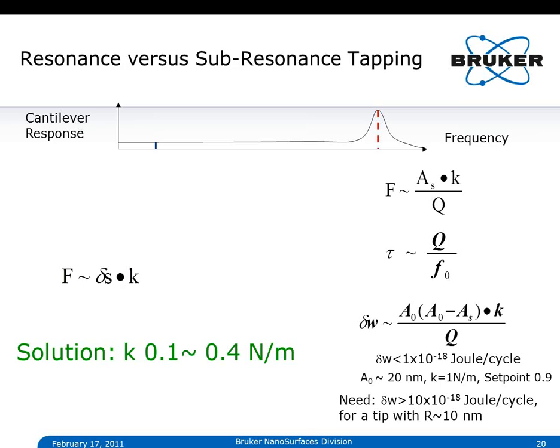And the trick here is that we do not use the cantilever in itself to establish the feedback condition as we use in tapping mode. We separate effects here because we use the Z piezo to move the cantilever up and down and pull it free of the adhesion layer. The Z piezo has infinite stiffness, infinite power for our specific application here. So by separating effects here, we can use a very soft cantilever and then gain a significant amount of force resolution.